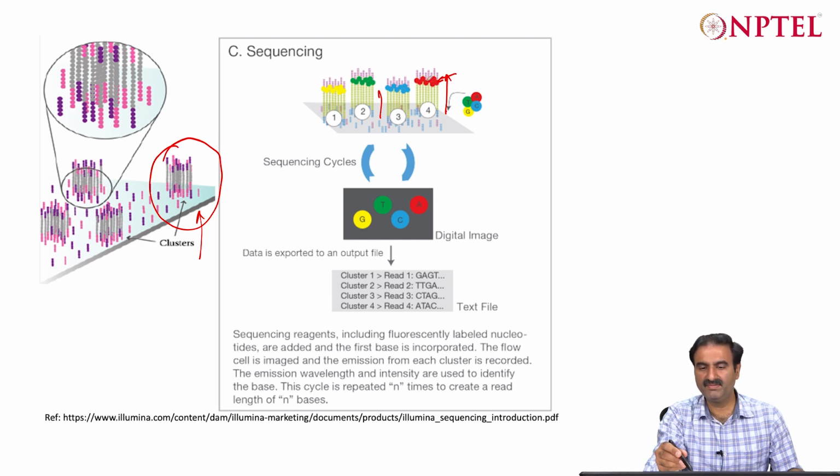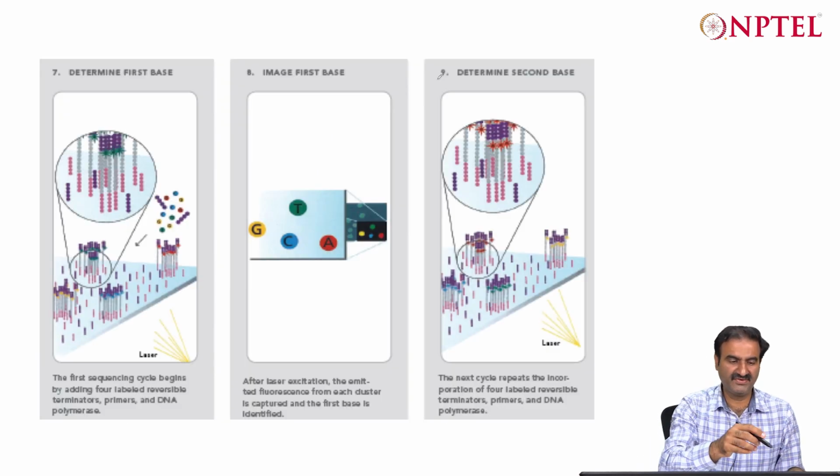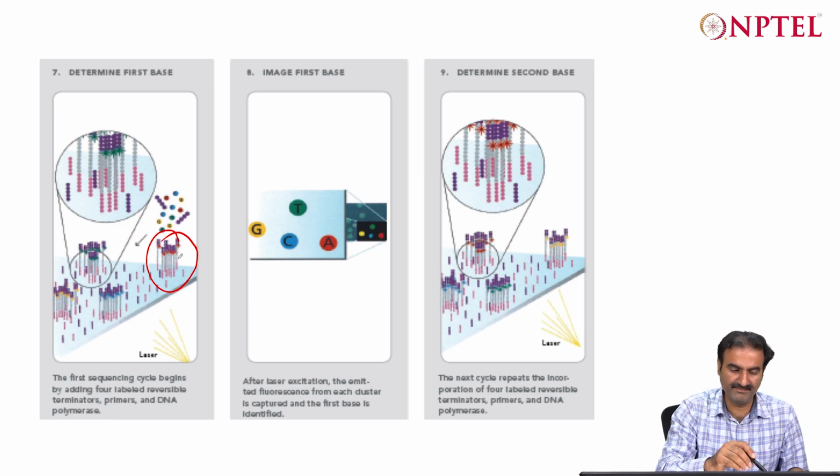So all the pieces will give the signal A once the DNA polymerase is acting there, and this is called a sequencing cycle. Now you can see that each position contains multiple copies of the same DNA fragment. When I start the sequencing for this fragment, I put a primer, and then one nucleotide gets inserted, since the polymerase was there.